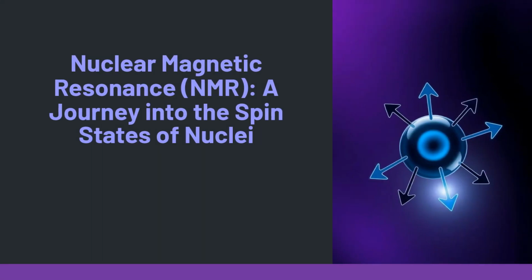Nuclear magnetic resonance, NMR, is a powerful analytical technique that explores the spin states of nuclei in a magnetic field. By understanding these interactions, we can unravel molecular structures and dynamics, leading to advancements in chemistry, medicine, and materials science. Join us on this journey into the fascinating world of NMR.